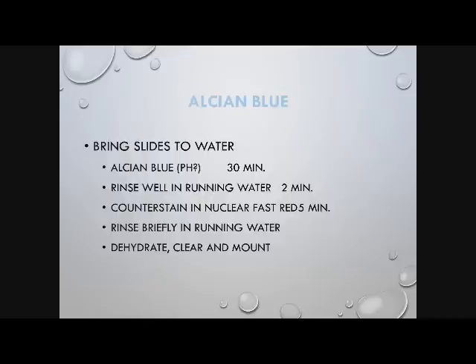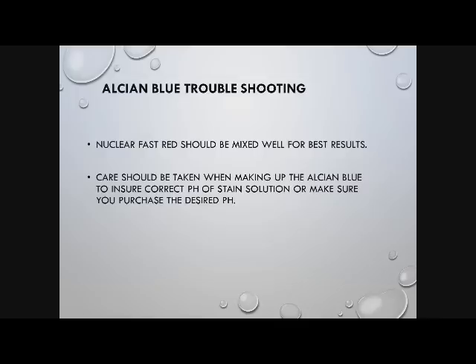So Alcian Blue, like I said, I threw in some generic processes or protocols. Simple stain. You just get the pH right, and you run it down, you incubate it, and wash it, and counterstain it. Simple. These protocols are mostly for you to have in case you want to try some, or you don't have a good protocol that works. Any one that I show you has been tried and tested and works very well.